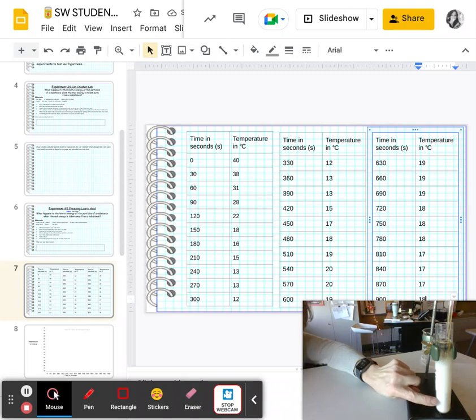Okay, so this is called freezing lauric acid because we took a liquid and we froze it. Okay, and our temperature is nearing room temperature. So for lauric acid, it freezes at room temperature, and we just did it very quickly by using the cold water. All right, so I'm going to let this just kind of sit for however long it takes, and then I'm going to pause the video and come back to it when it feels a little bit more like room temperature, but already I can see that the thermometer is going up very slowly, making its way to room temperature.